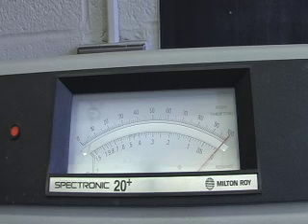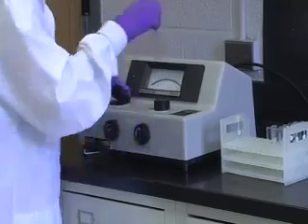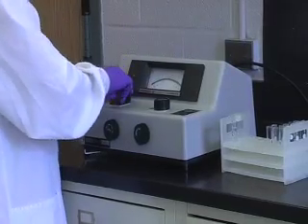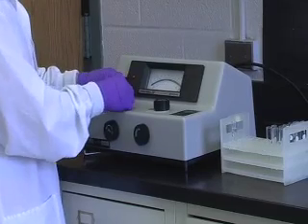After zeroing and blanking, remove the blank cuvette. Place a cuvette with at least 3 ml of sample into the sample holder and read the transmittance or absorbance from the scale.